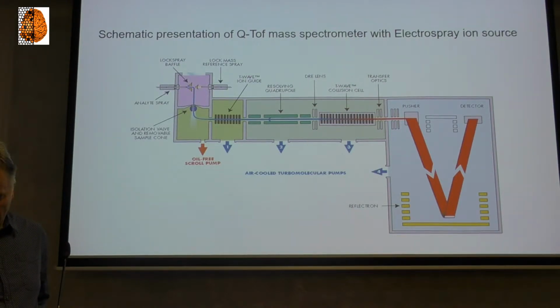And then after that, the injection from HPLC or UPLC goes through the electrospray ion source, and after chromatographic separation, we finally have on the detector separated compounds which are characterized with mass spectrometric measurements.